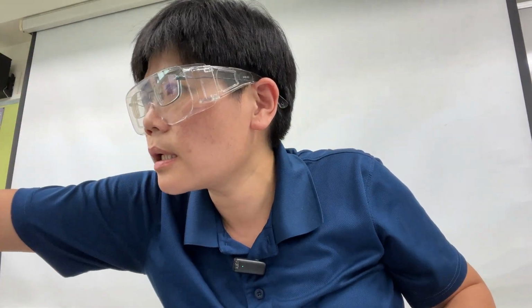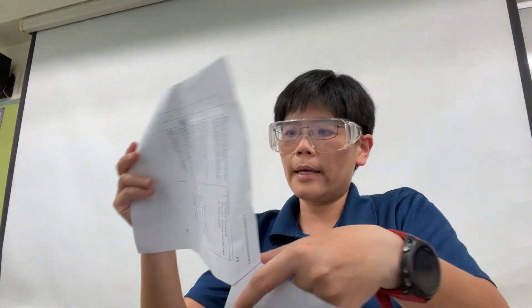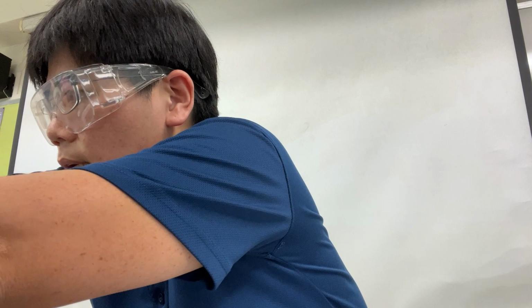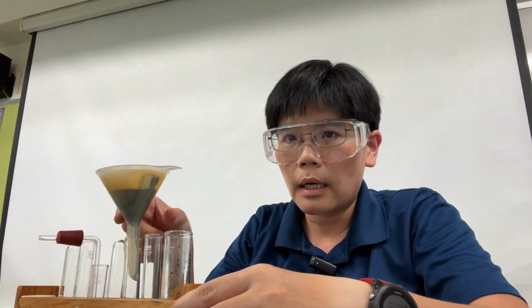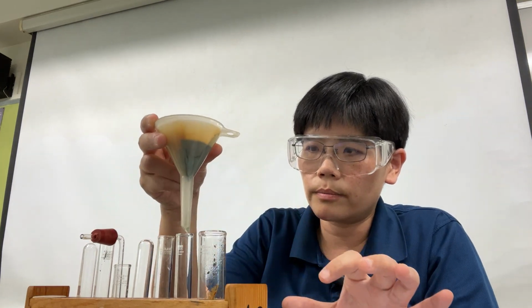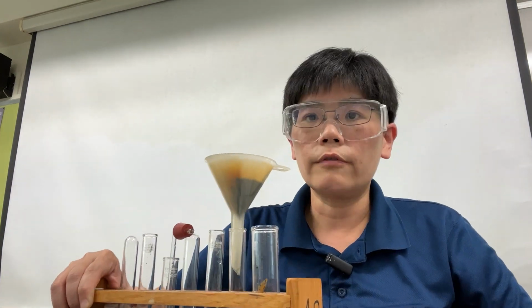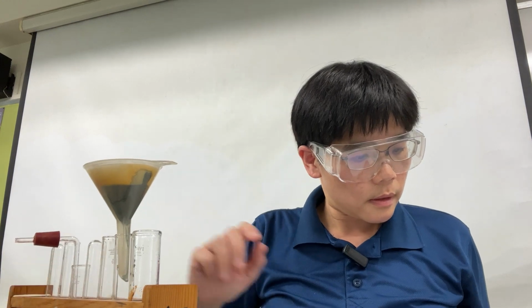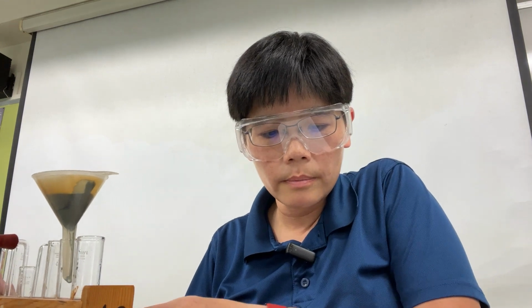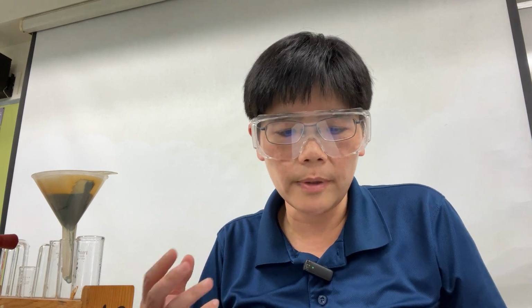At this juncture, I am ready to go back to the filtration that I did. The filtrate is now running clear. So I'm going to shift the filter funnel into the other test tube and allow the mixture to continue filtering. So now B part 2 has finished. While you are waiting for the contents of the tube to settle, continue with B part 3 and part C.